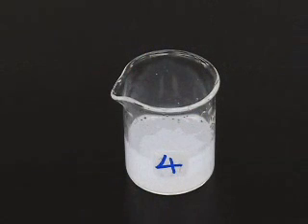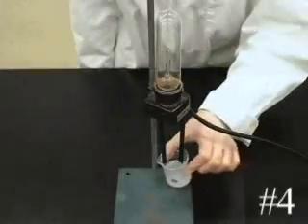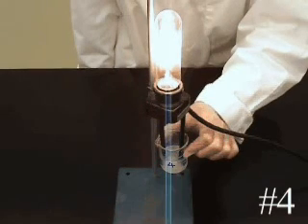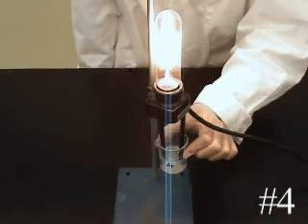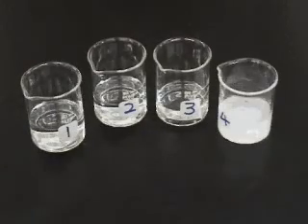Solid number 4 did not completely dissolve in the water, so we have a cloudy suspension. Record your observation. We now have enough information to identify the solid used to prepare each of these solutions.